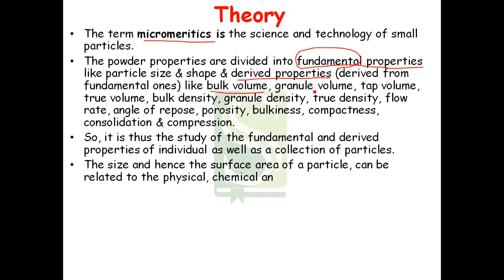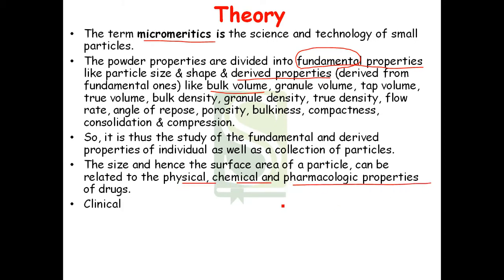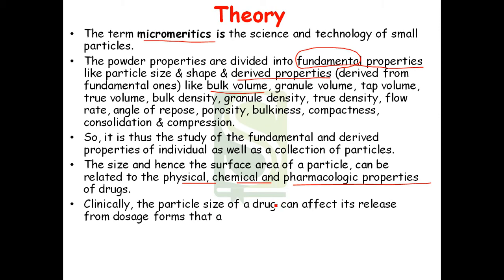The size and the surface area of the particle can be related to the physical, chemical and pharmacologic properties of the drugs. Clinically, the particle size of a drug can affect its release from the dosage forms that are administered orally, parenterally, rectally and topically.